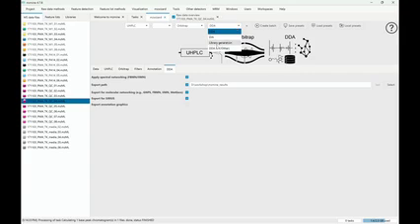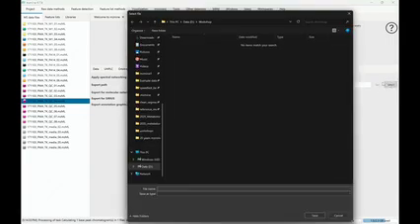And then in the end, there's the DDA, which is the workflow. Later, we're going to see there's also library generation and data-independent acquisition. So if you do something else, you can always just change it here. But with this, the only thing you have to do is select an export path. Selecting the export path again, you just go on select. And in here, you select a folder, and you also need to select a base file name.